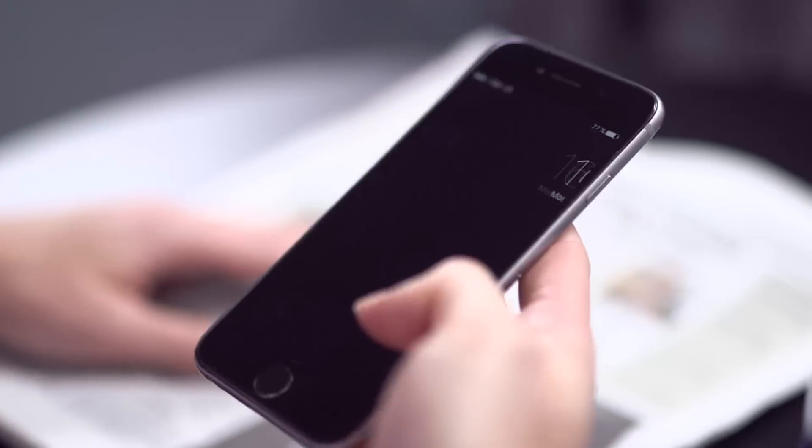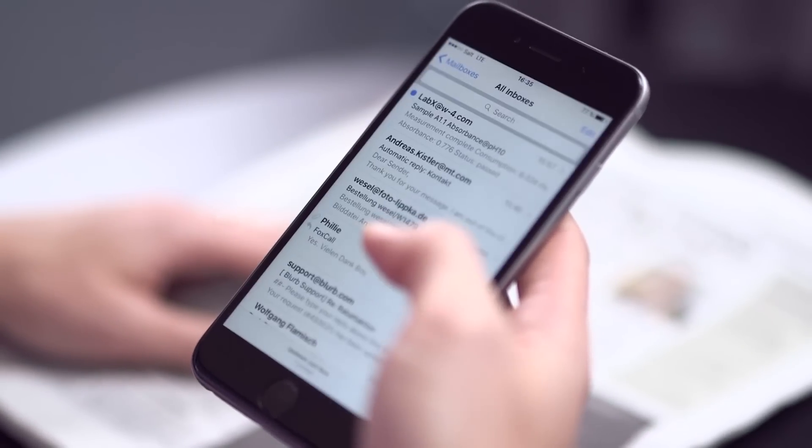Whenever you are on the go or away from the titrator, LabX mail can be used to send the results by email.